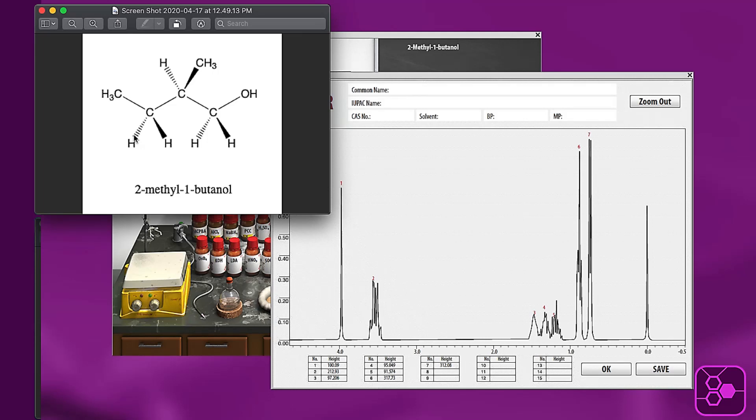In this video I'm not going to cover everything about deciphering a proton NMR. There's tons to it that you will have learned or will be learning in your organic chemistry classes. I'm just going to be covering a couple of specific things and how our software spectrum can be used to fill out your worksheets or to decipher your product and where the peaks correspond to in the spectrum.